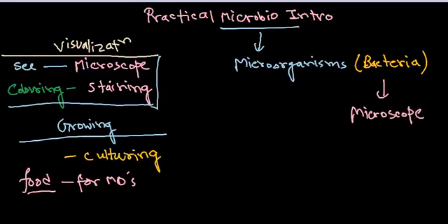Now it's very easy to grow microorganisms, because what you need to do is simply supply some food, and add the microorganism there, a very tiny amount of microorganism, and those tiny amounts of microorganisms start to eat that food and start to grow on that food, right? So it's very easy, just like you've seen many organisms growing in front of your eyes, because though they are not micro, you can see them with your eye, but they are very small.